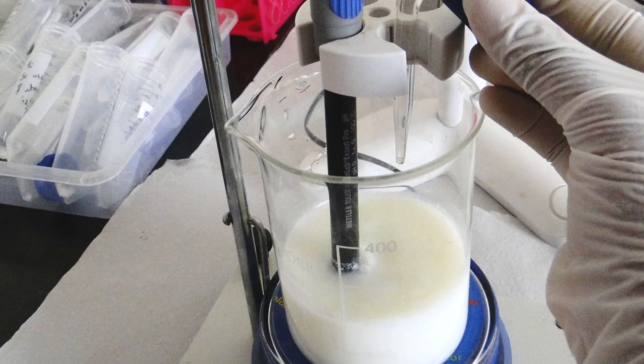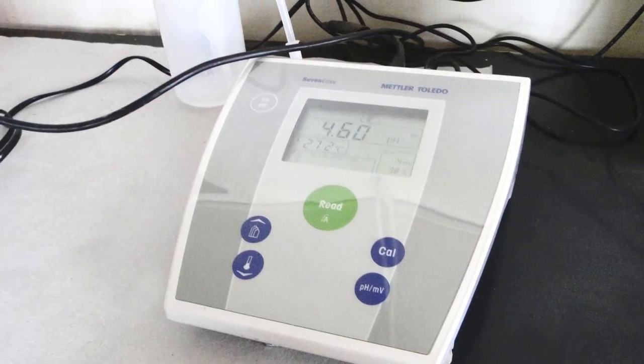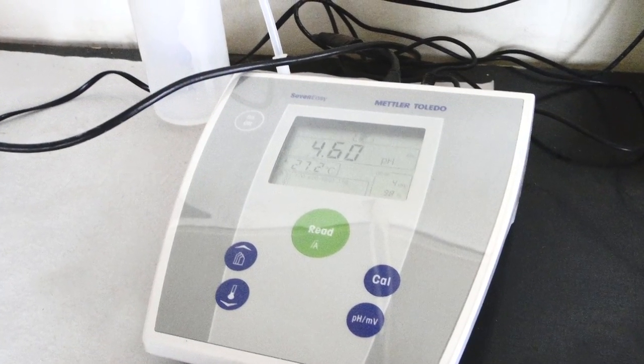While stirring the milk, add HCl drop by drop. Casein starts precipitating at a pH between 4.8 to 4.6.